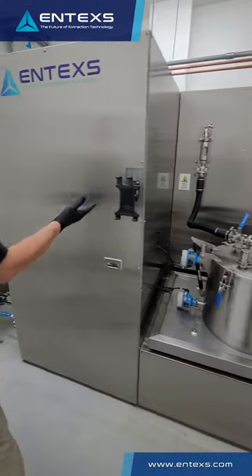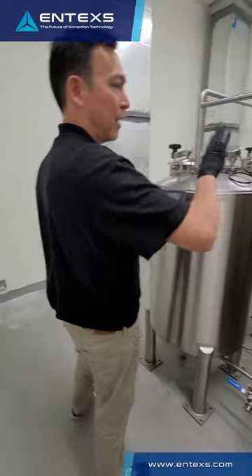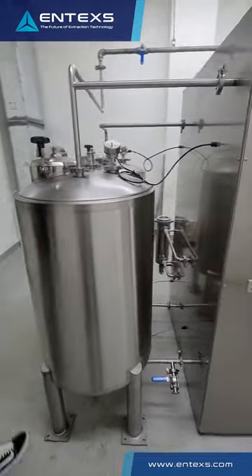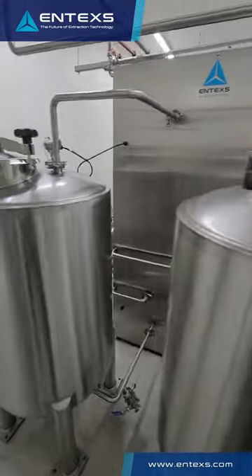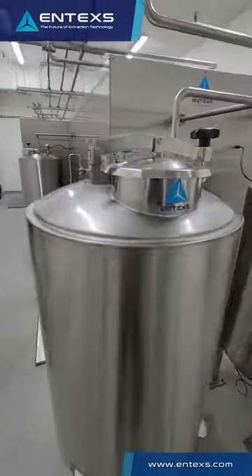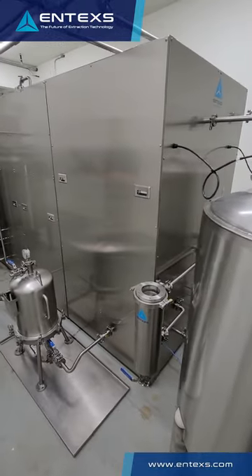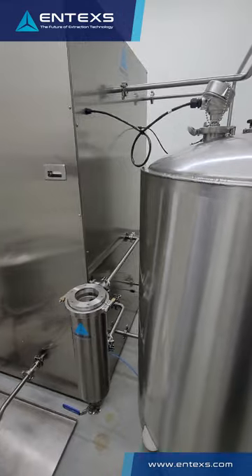We monitor both on the extraction loop and we monitor post-filtered tincture coming out of the carbon and particulate filter sets. A key design feature is the paneling of all of the interior gray spaces of the equipment, so the working surfaces are very clean. All of the sensors are required to be routed inside the equipment. The panels allow for a very clean work environment that's very cleanable and sanitary.